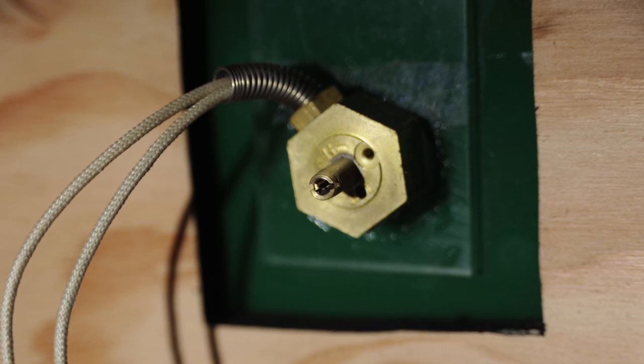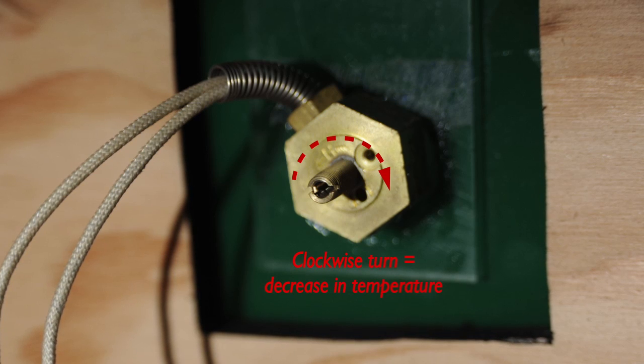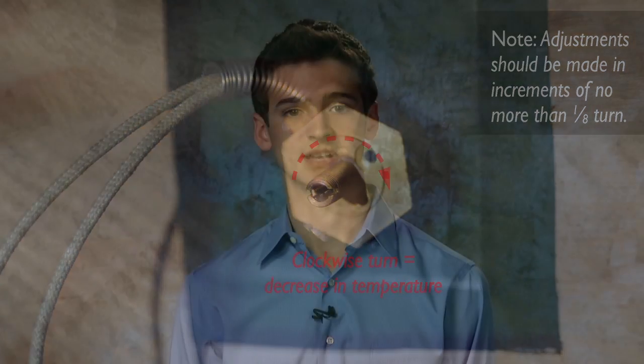If it is necessary to change the temperature, the thermostat can be adjusted. Turning the adjustment screw clockwise decreases the temperature. Adjustments should be made in increments of no more than one-eighth turn. Allow adequate time for stabilization before making additional adjustments.